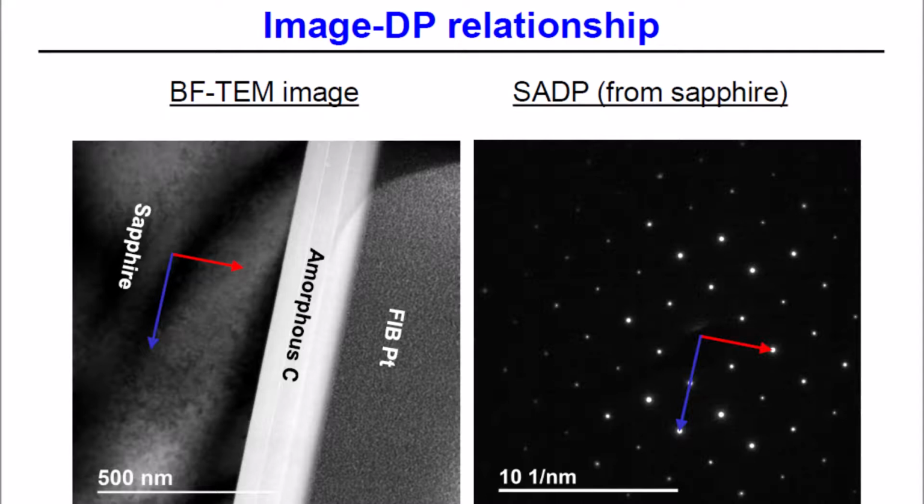But if you have an older microscope, and specifically if you're watching this, you probably have a Tecnai, then this is something that you will need to do. I did work on a JEOL 2010F. On the JEOL 2010F, it's not necessary to do this. The JEOL 2010Fs do not need rotation calibration, but the Tecnai instruments do. I also worked on a JEOL 200CX for a number of years, and that's a very old instrument, and that also needs rotation calibration performed.